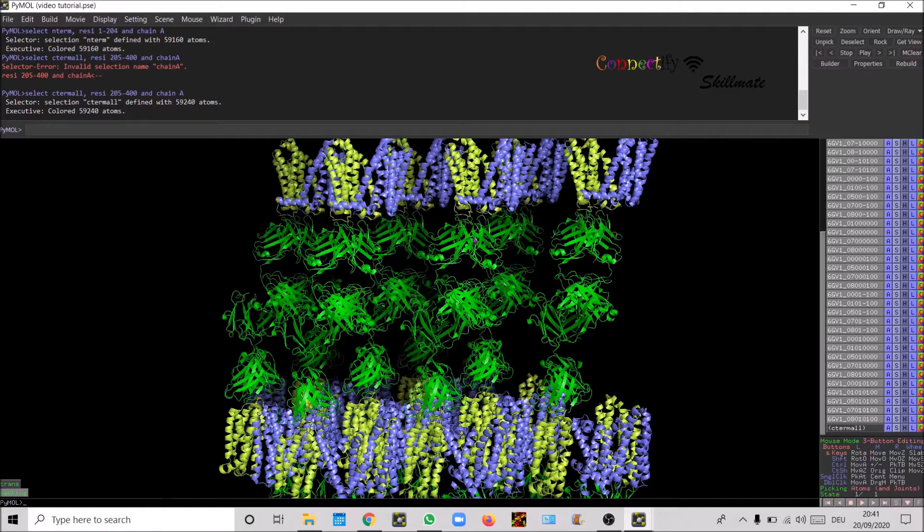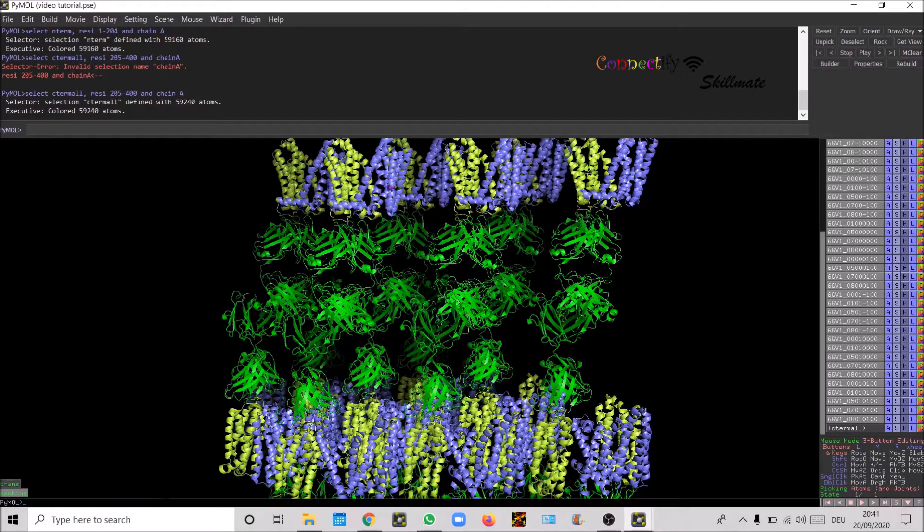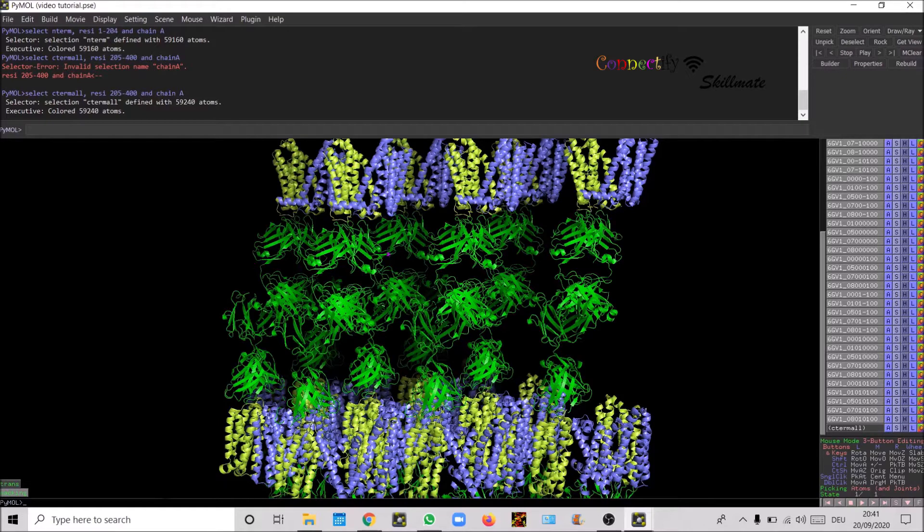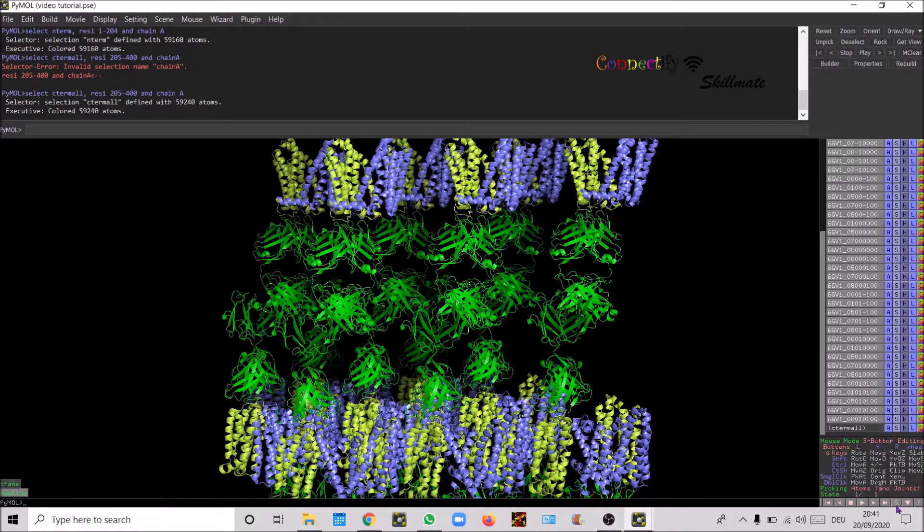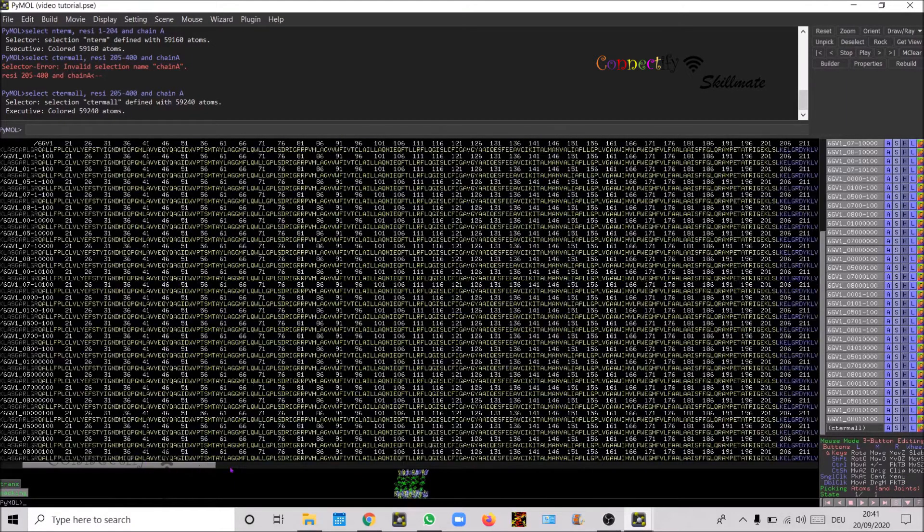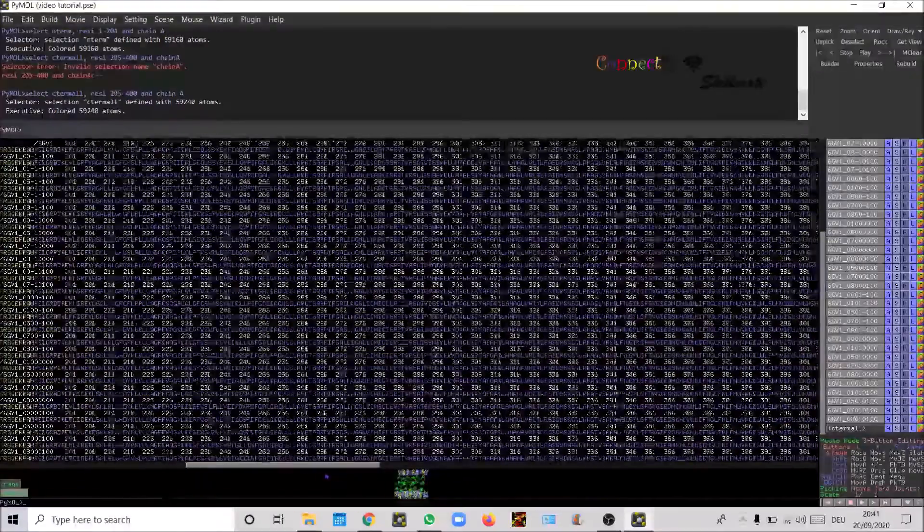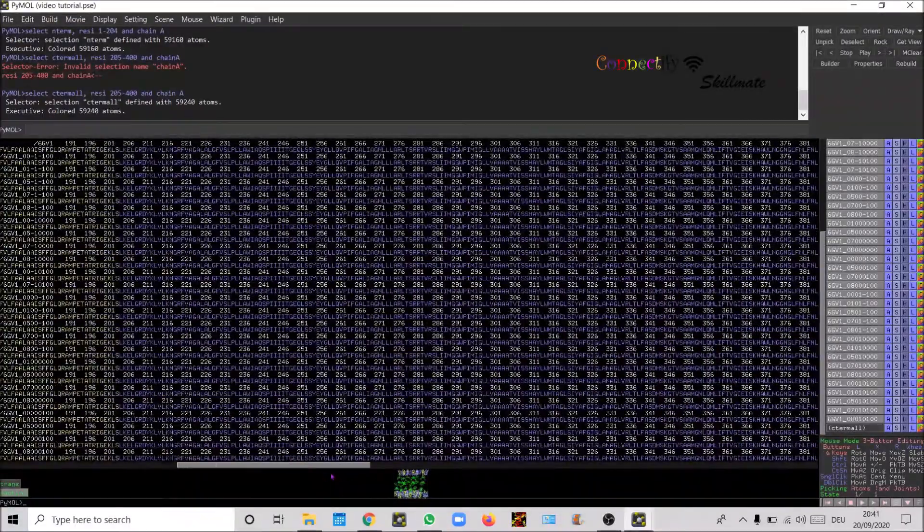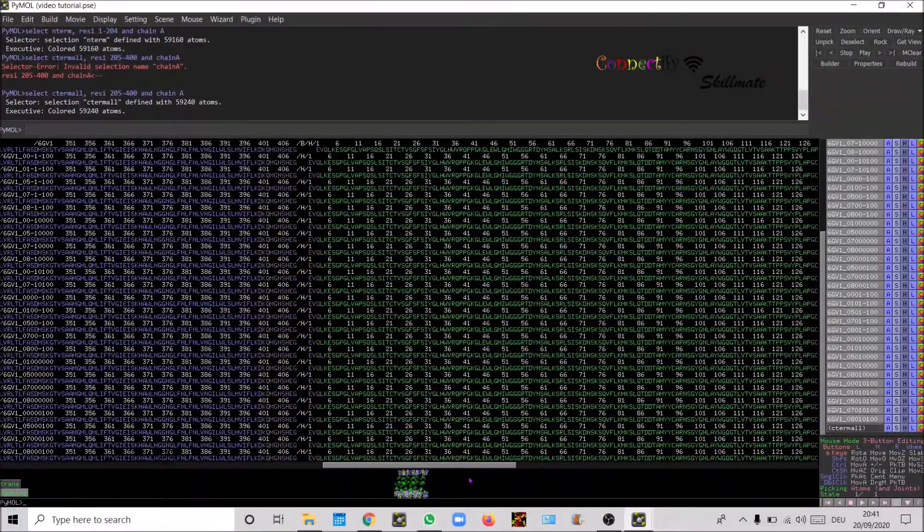Now let's differentiate the light chain and the heavy chain in the fab by different colors. In order to know which chain do they belong to, just click over and then you will see all the molecules are defined.